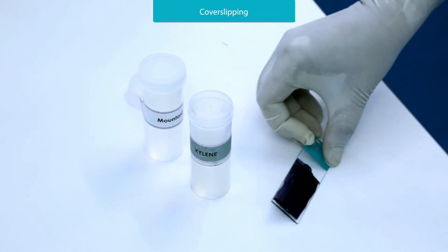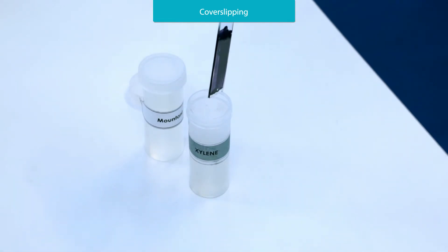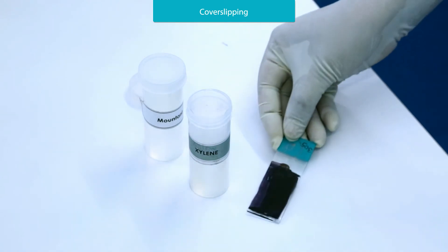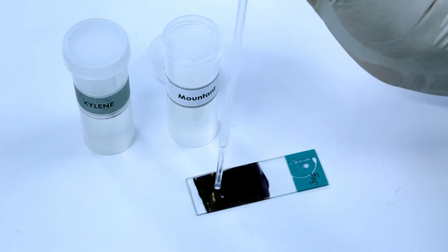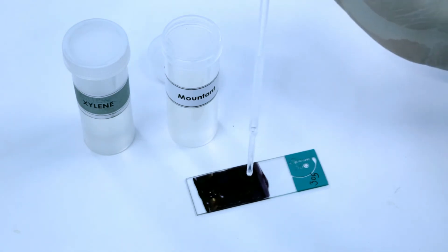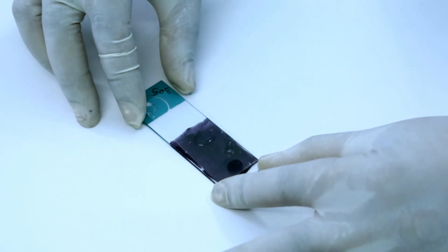Take the stained slide and dip it into xylene, then take the slide out. Place the mounting medium on the slide. Place a cover slip on the slide, avoiding air bubbles.